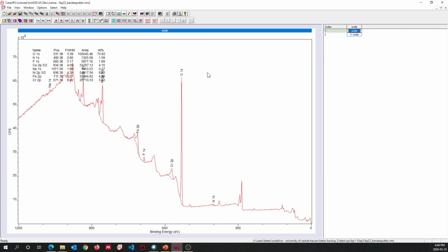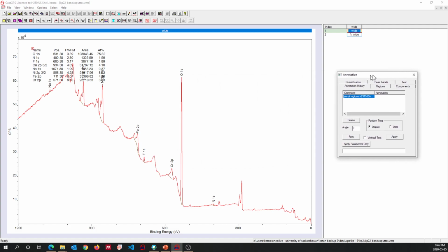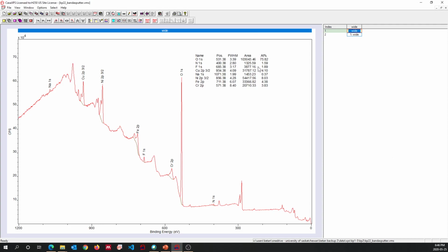That's why I was saying, oh, where did the option go? So this is the one, pencil. It's high annotation. Click there. Now you can move. You see that red box? You can move around your table now. Okay, let's close it. This looks fine.